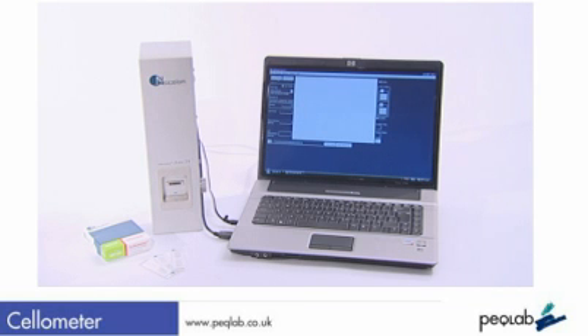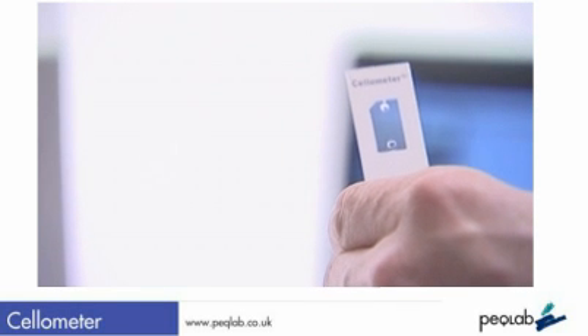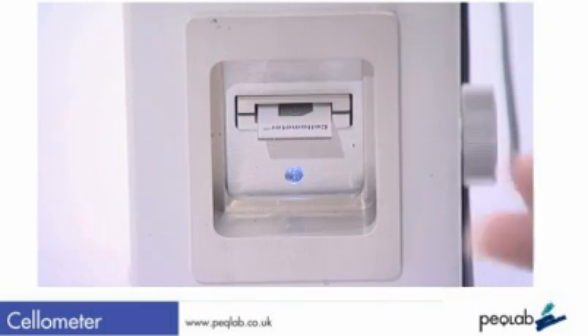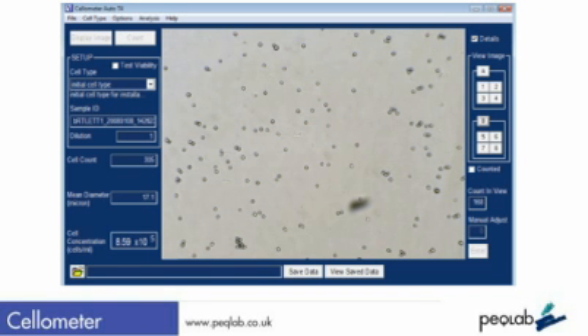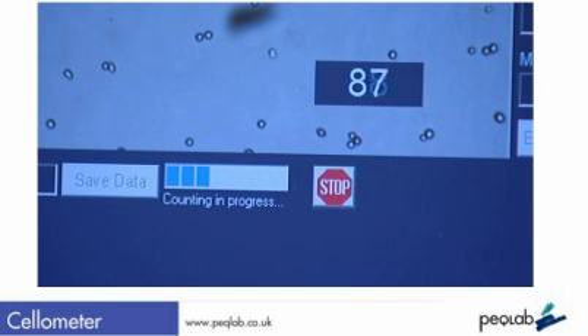The system uses just 20 microlitres of cell solution pipetted into the counting chamber. This non-glass slide is inserted into the system. Here we can see the cells on screen. Press count and the system will count the cells in around 30 seconds.